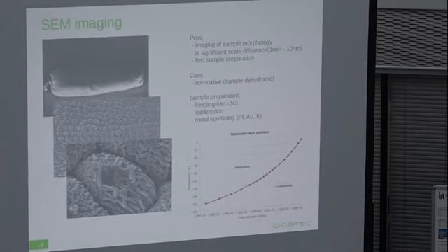The other example shows that we can go across a wide variety of scales. So this is the plant female organ. It is 2 millimeters in size. And you can also depict it in the scanning electron microscope. But then you can zoom in to the level of individual cells, scaling this range of magnifications that I tried to show you earlier. For this particular experiment, since this contains more residual water, the imaging in this case is done at cryo conditions, but before imaging we do so-called sublimation.